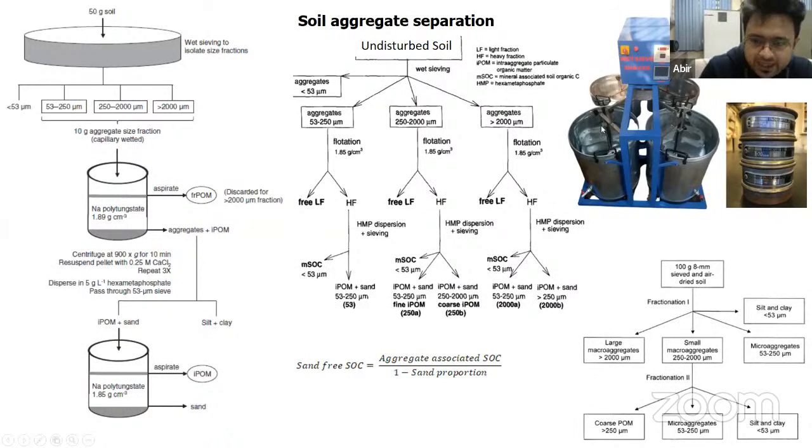After all the pores are filled with water, then you go for this wet sieve shaking. It will be a vertical movement, say for 10 minutes, and in those 10 minutes it will be vigorously pushed back and forth, up and down, up and down. So the soil will be facing some eroding forces, and whatever aggregates are there will break down and come onto the lower sieves.